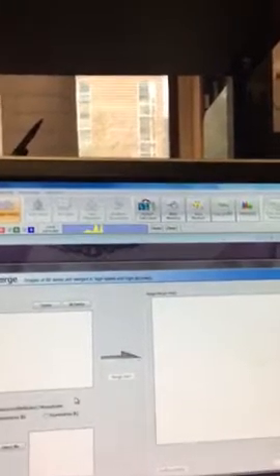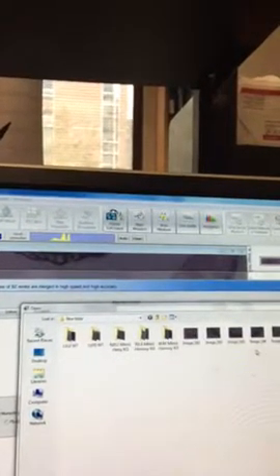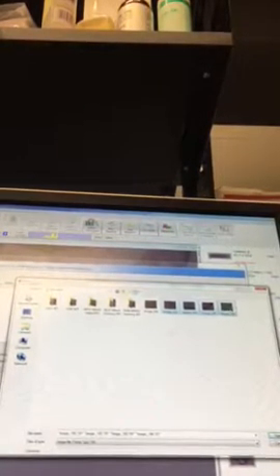Now it's going to ask you, what files do you want to merge? Hit add. And you see that by default, this software dumps it in something called new folder on the desktop. So don't worry about where it's going for now. Just go to the new folder, grab the images with the control, say open. Now merge them, and it automatically puts them together for you.